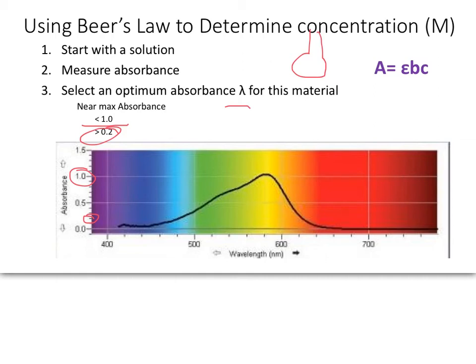So I'm going to pick a point. This is 550 here, this is 560. I'm going to pick a point of 565 nanometers.